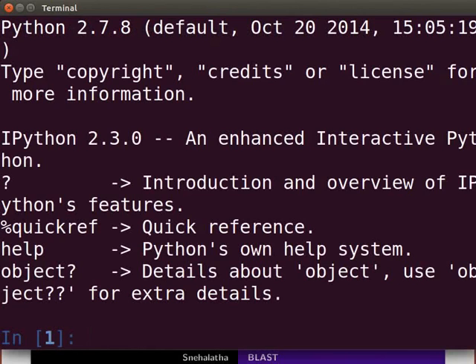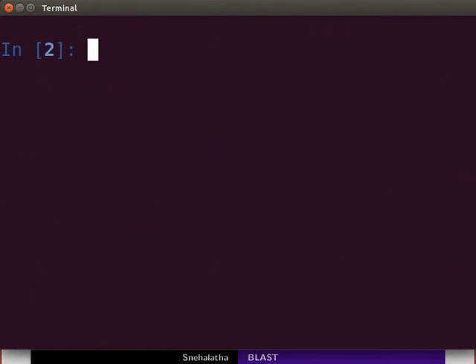In this tutorial, I will demonstrate how to run BLAST over the internet using NCBI BLAST service. Type the following at the prompt.